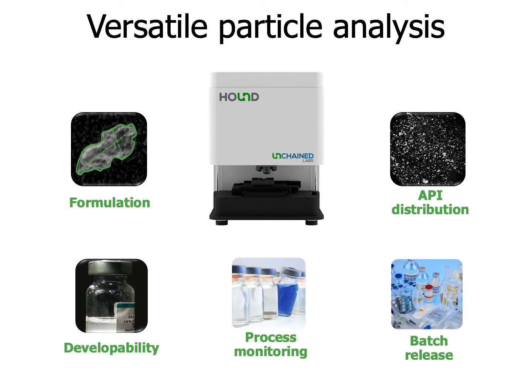I hope in this brief talk I've given you some idea about how Hound can be used in a complement of different applications where you need particle analysis and identification.